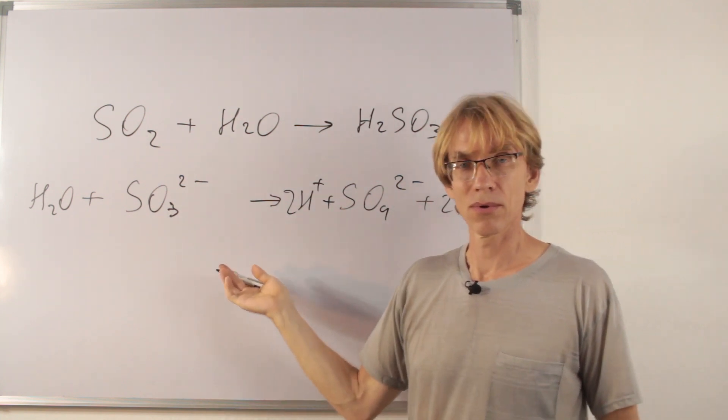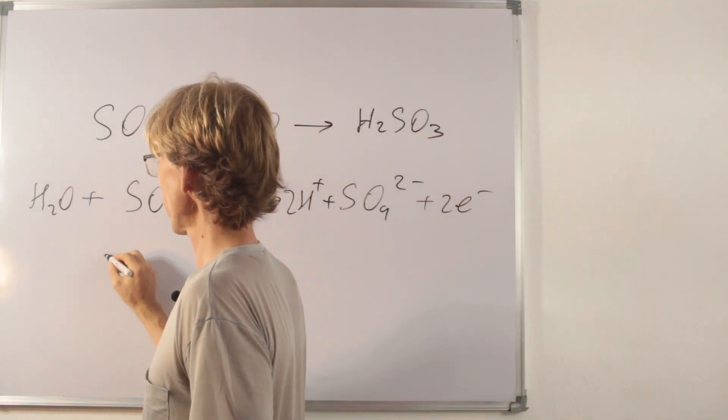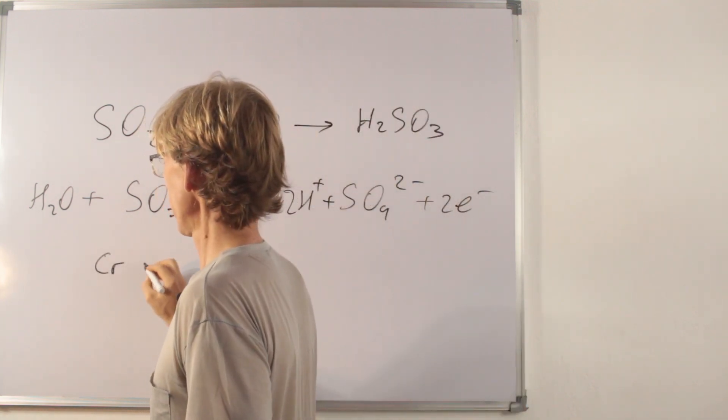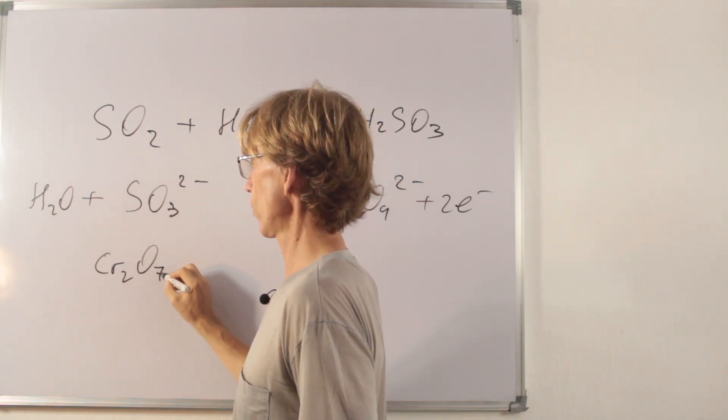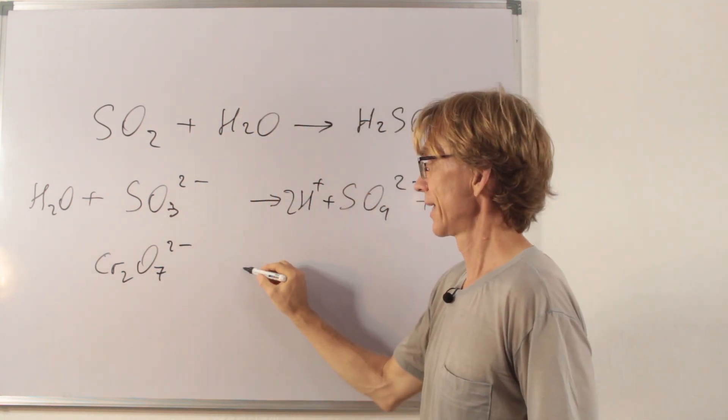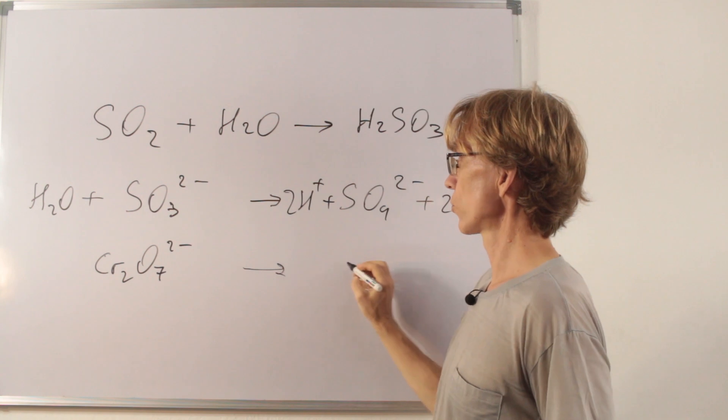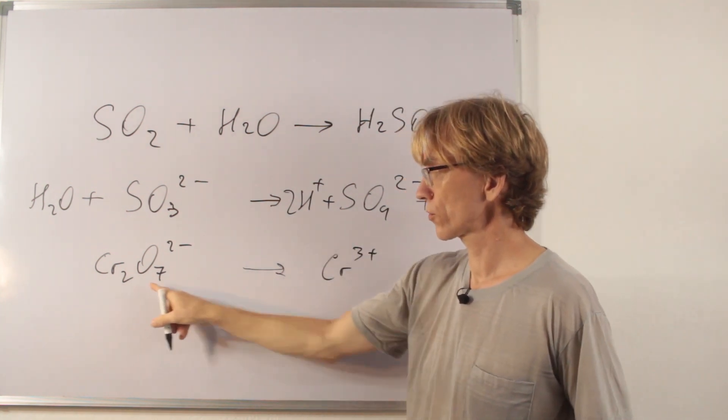And now for oxidizing agent side. Potassium dichromate we used. But the ion which is interesting to us is Cr2O7 2- dichromate ion. So, it is changing into green chromium 3 plus. Orange, green.